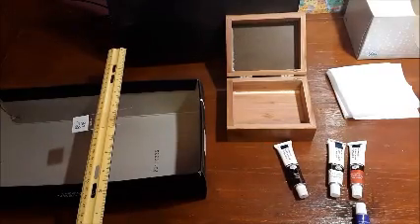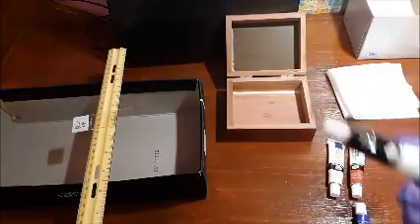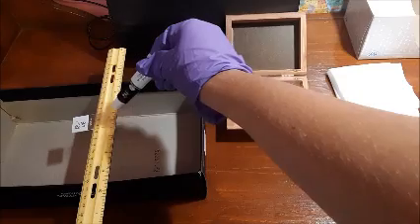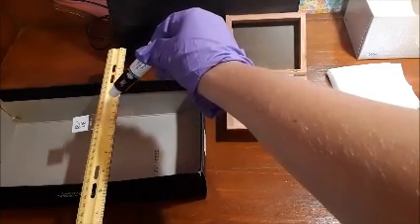Okay, so the next step that you're going to do is you're going to flood your smear with gram's iodine. And you're going to apply this to the slide for about 60 seconds. But for this experiment, I'm just going to speed it up.